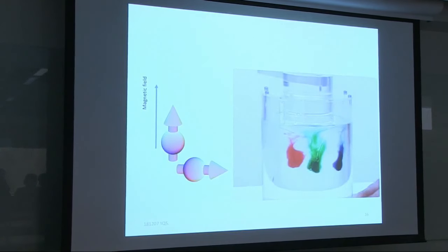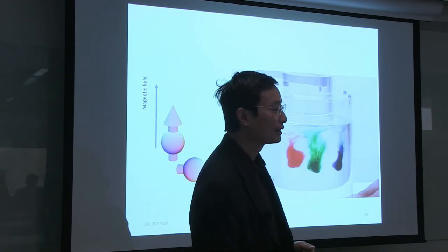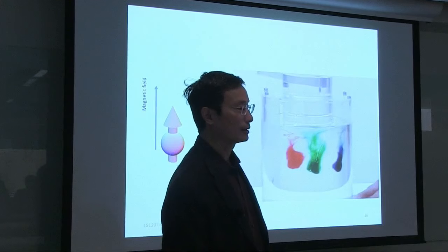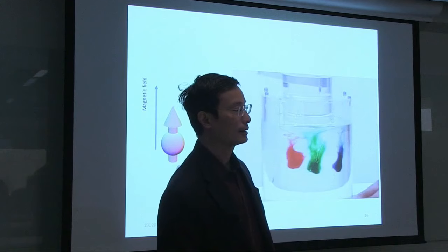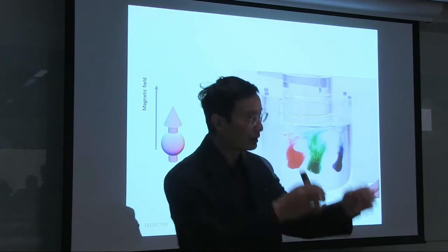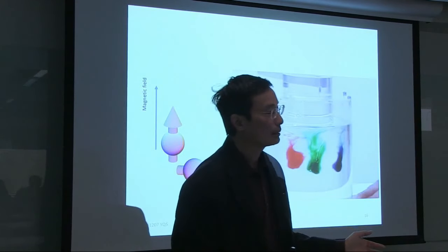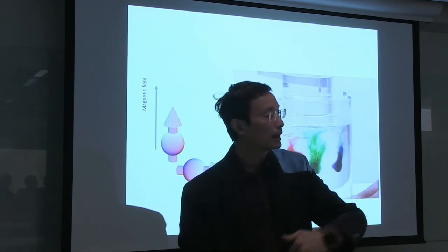Are the dyes distinguished by molecular size? Sorry? They're different molecules, different properties. Being distinguished? You mean different colors? I see that they're different colors, but I suspect that they are moving the way they're moving not because of being different colors, but because of being different chemically. No, when you put them in there, they're just in different spots. They're being dragged by the fluid. So it means that even though they look mixed, they're actually not mixed. If you follow the flow line, if you reverse it, they will all come back.